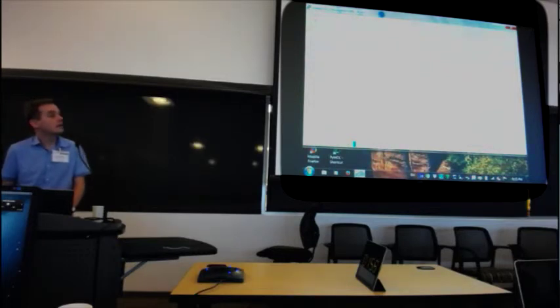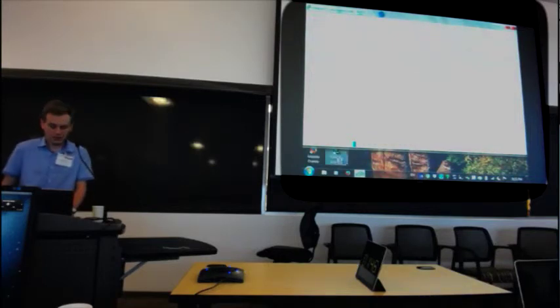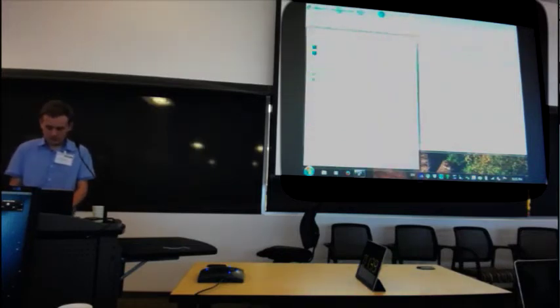Okay. So it will take time for all of your jobs to finish, but once they do, I hope you now know how to get to the HKL file and then to MTZ, and then you can copy the MTZ file to your local machine and try to run PHENIX on it.